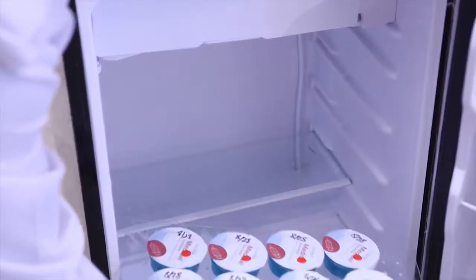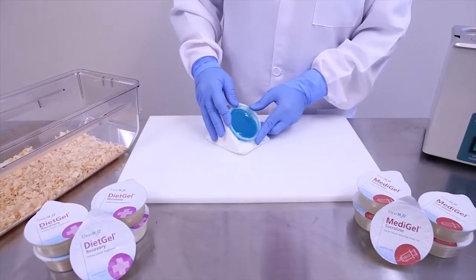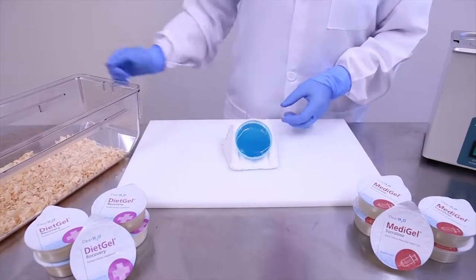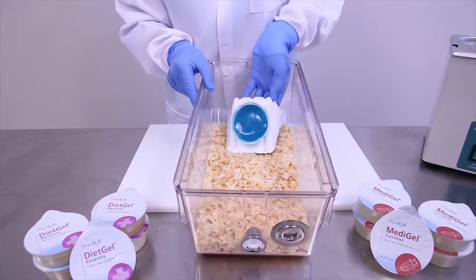To accelerate the re-solidification process, you can place the cups in the refrigerator and they can remain there until they are needed for application. Once re-solidification has occurred, the cups are ready for application of medication delivery in the rodent cages.